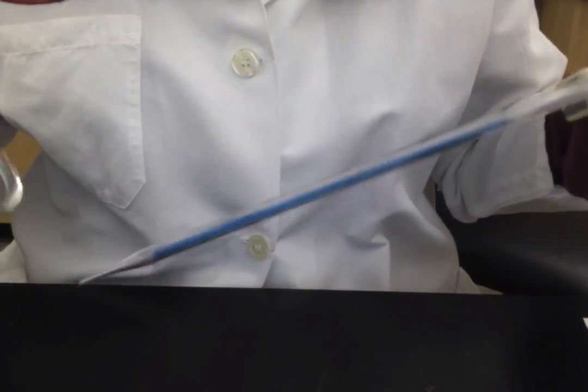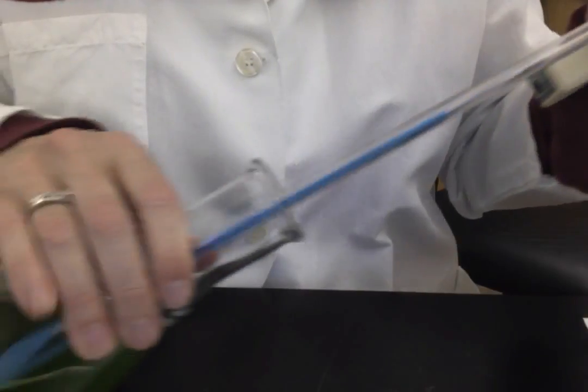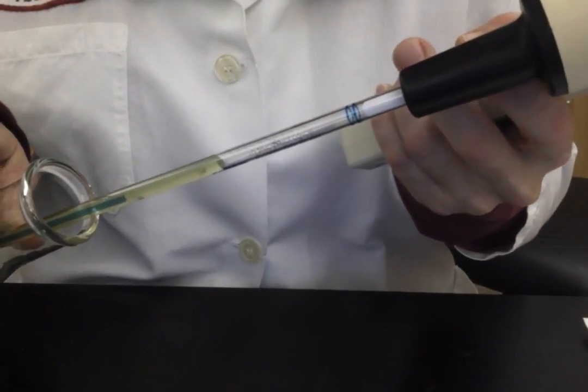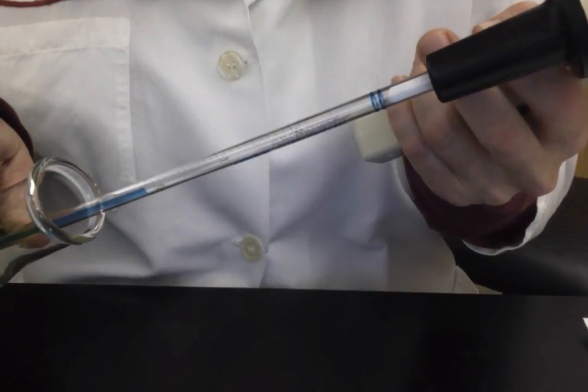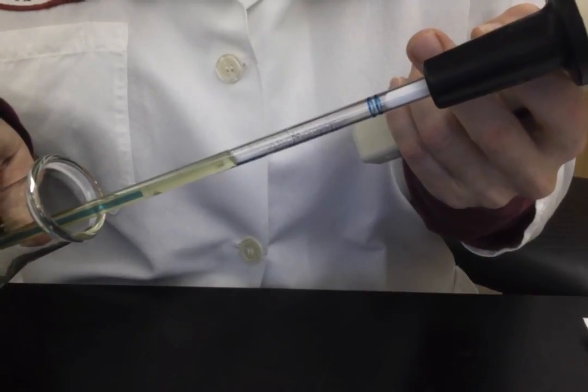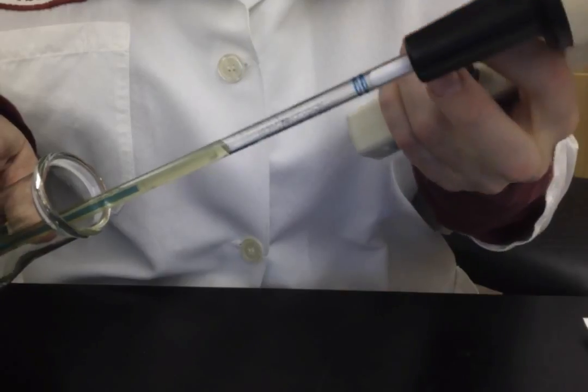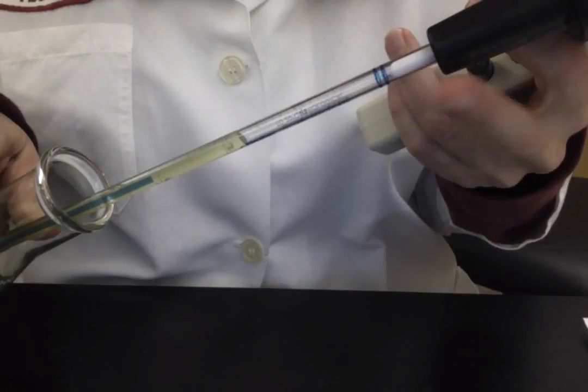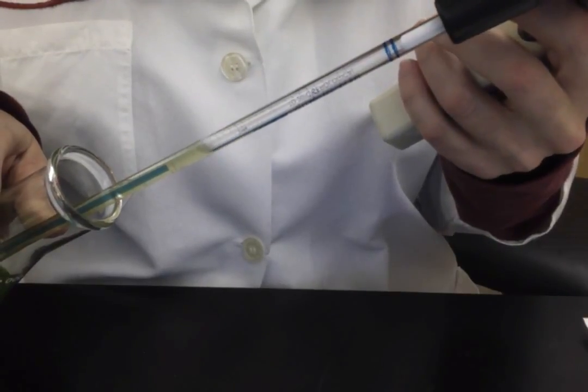To get fluid, you pull up, and to expel it, you push down. You never want to go too close to those two blue lines at the top of the pipette in order to protect the fluid from getting into this cotton and then into the filter.